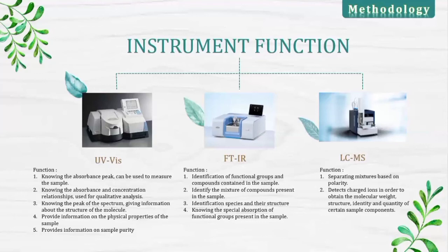Instrument function of LC-MS. 1. Separating a mixture based on polarity. 2. Detect charged ions in order to obtain the molecular weight, structure, identity, and quantity of certain sample components. On this instrument, the specific weight will be known, like the steroid that has a beta-sitosterol compound.